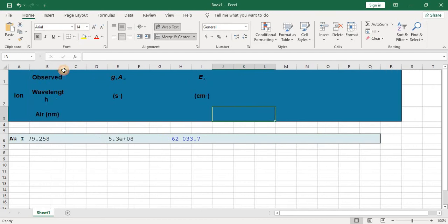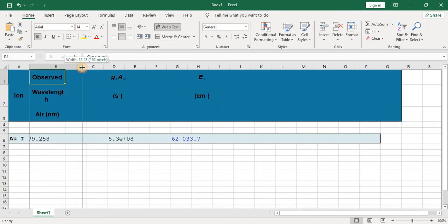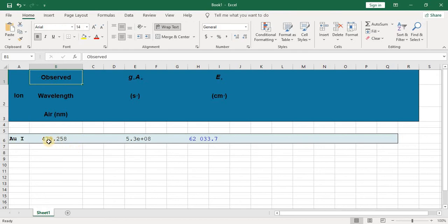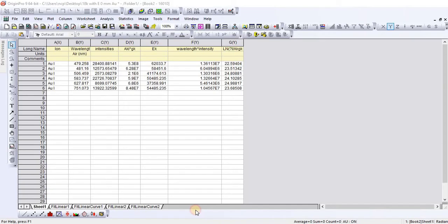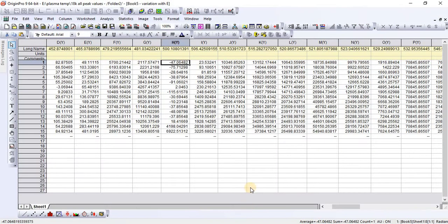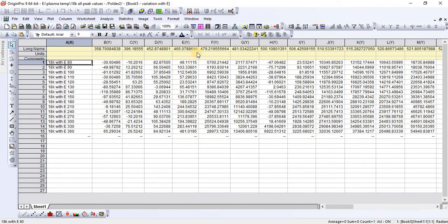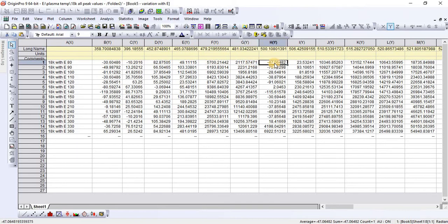The first column contains wavelength, which you can note from the Excel sheet — for example, the wavelength is 479.258. The next column is intensity, which you find from the data taken from the LIBS experiment. For example, my first line is 479 with its corresponding intensity, the second line is 481, the third is 506, and so on — all lines with their intensities.